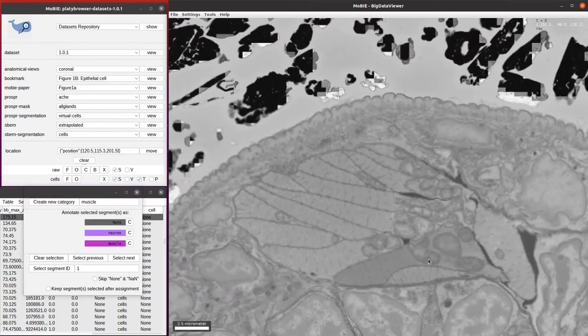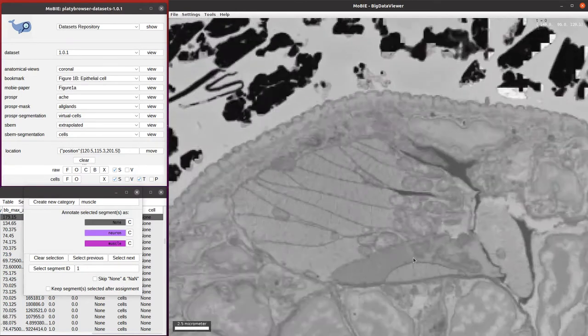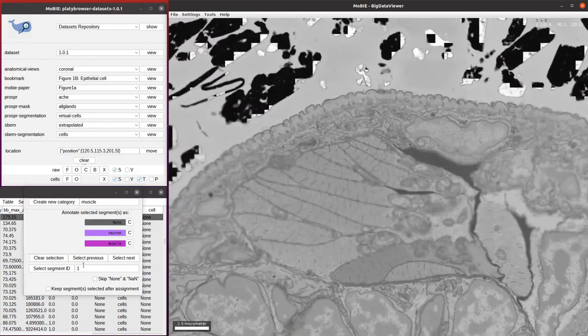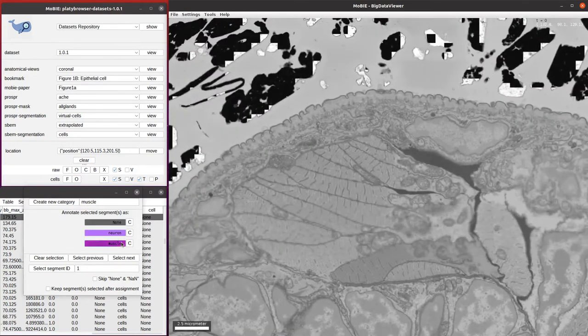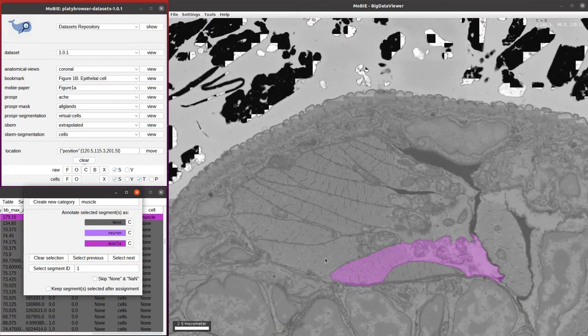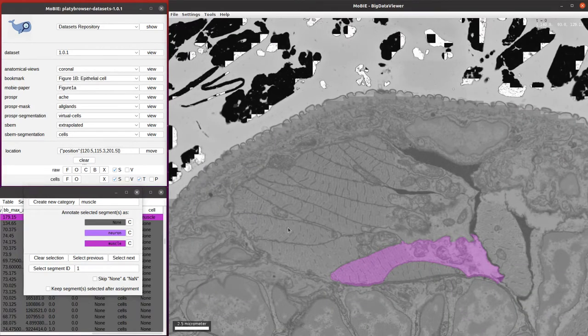This is a muscle cell. Once we're satisfied it's a muscle cell, we can click the muscle button to assign it as a muscle.